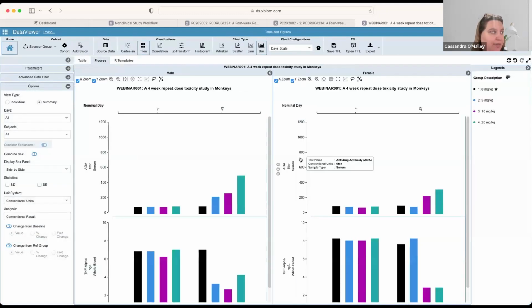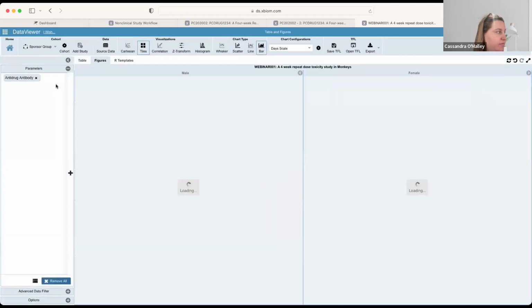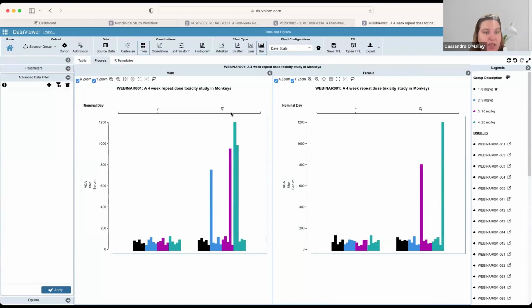I'm then going over to immunology. So we've also included immunology data in this study. We've mentioned that the study's route of administration was by intravenous use. It can be a biologic that is being sent for CBER for approval, and specifically this one is being used to study an anti-inflammatory agent. Blood samples were obtained from subjects on day -1 and day 28, same as the laboratory test, and we're going to be determining the anti-drug antibody titers, or ADA.